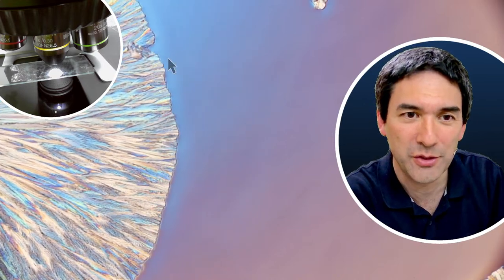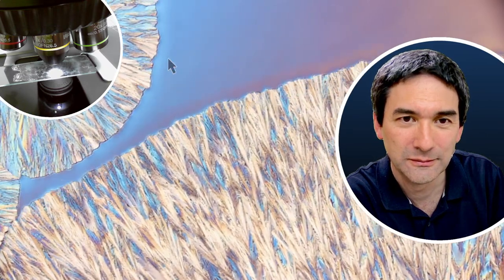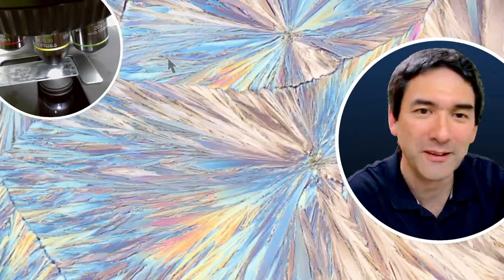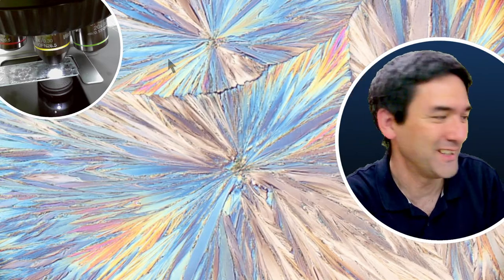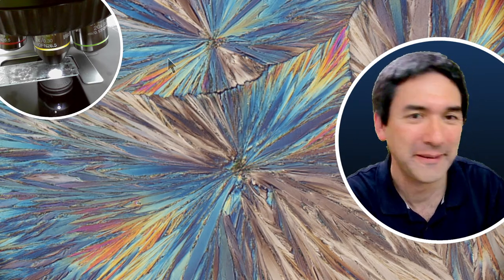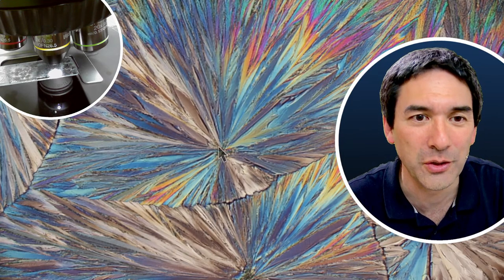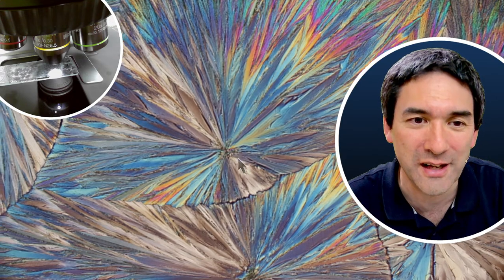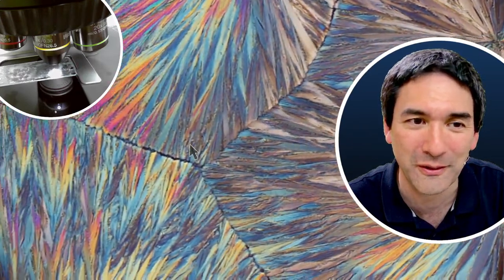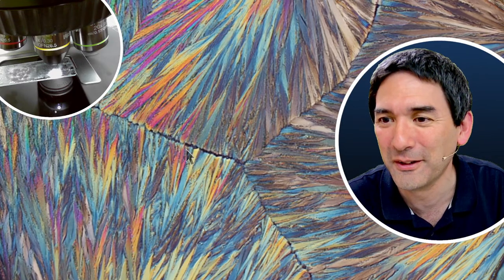So of course you see that the camera is much faster. I'm getting a much smoother image. Yep, and the slide is finished. Okay, so this is basically, I was a little bit too bright maybe. And again here, every time you see the center, this is where the crystallization started. And then it starts to crystallize outwards until adjacent crystals start to meet each other. And that's why you have those borders here. Okay, so this was just some fun that we had.